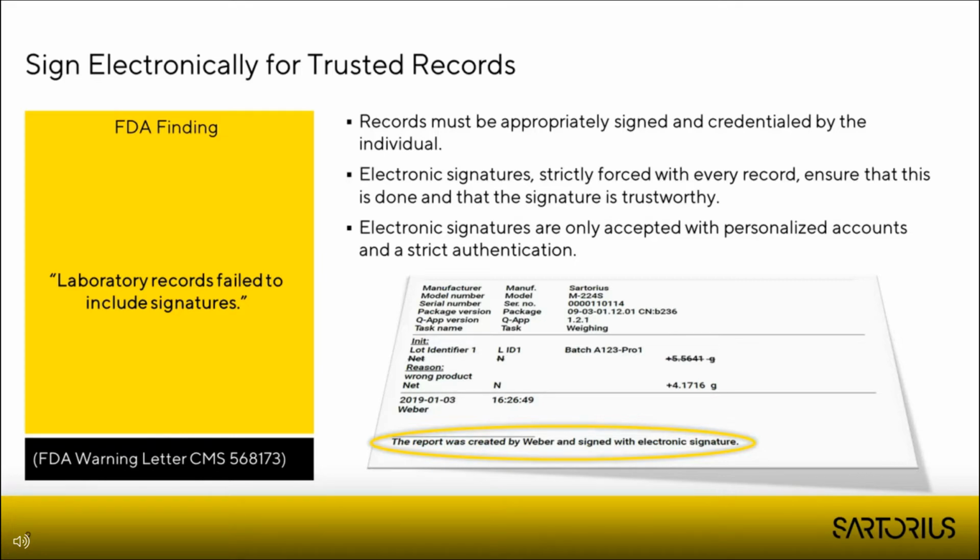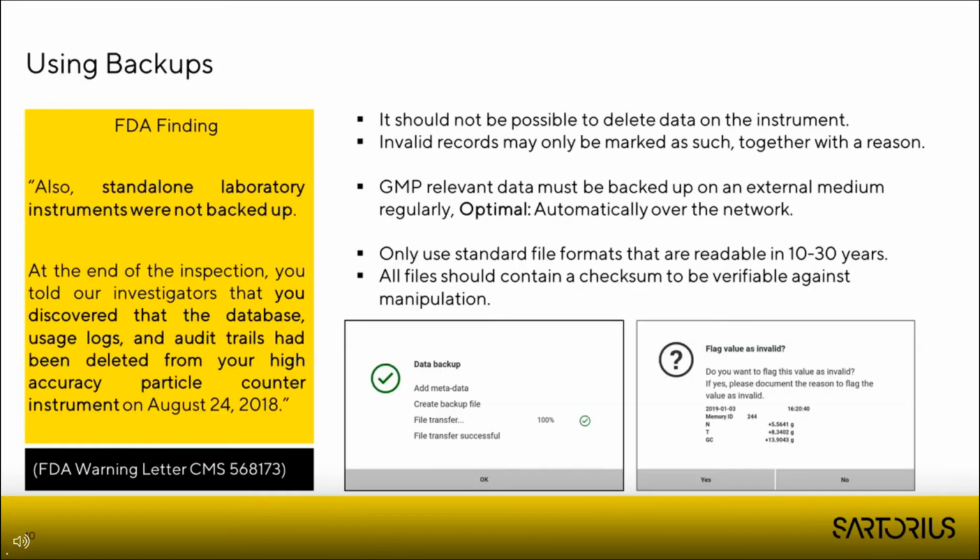So it's also a very good example again of how an electronic guided workflow can help you to enforce your data integrity initiative. Here we have also a very important topic, and this is backing up your instrument data. Especially for a standalone laboratory instrument like a balance, quite often you take care of your process data, like the single weighing result. But what about all the other data on the instrument, like audit trail, calibration logs, and method configuration, for example?